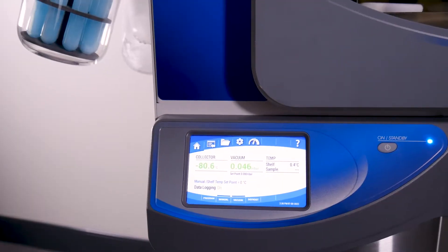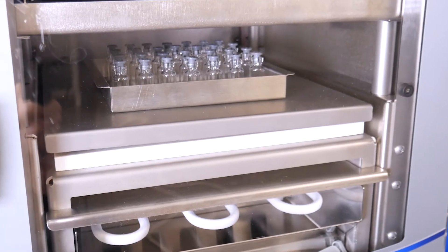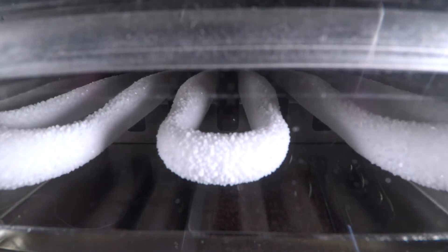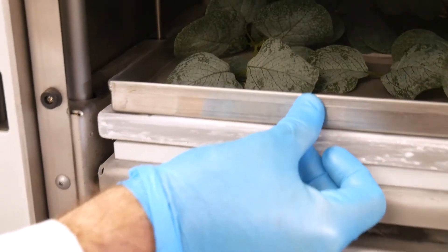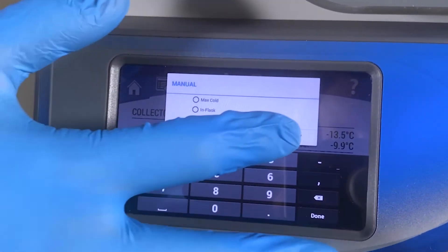The integrated stainless steel collector coil reaches negative 84 degrees Celsius to accommodate samples with low freezing points and holds up to 2.5 liters of ice. It boasts temperature controlled shelves ranging from 50 degrees Celsius to negative 55 degrees Celsius during lyophilization and negative 75 during pre-freezing.